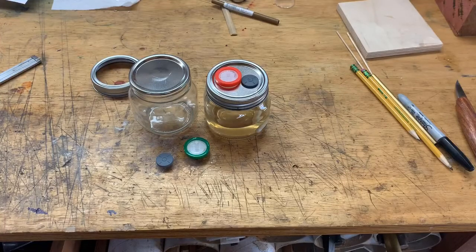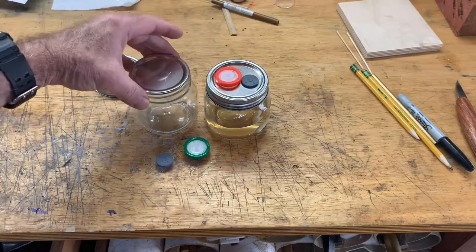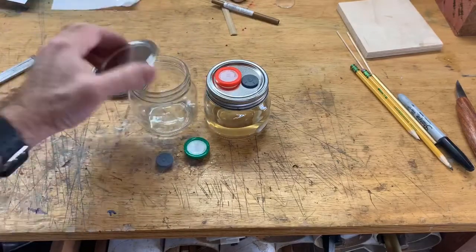Greetings, Dave here. Today I'm going to discuss how I make liquid culture, especially how I make the lids for it.